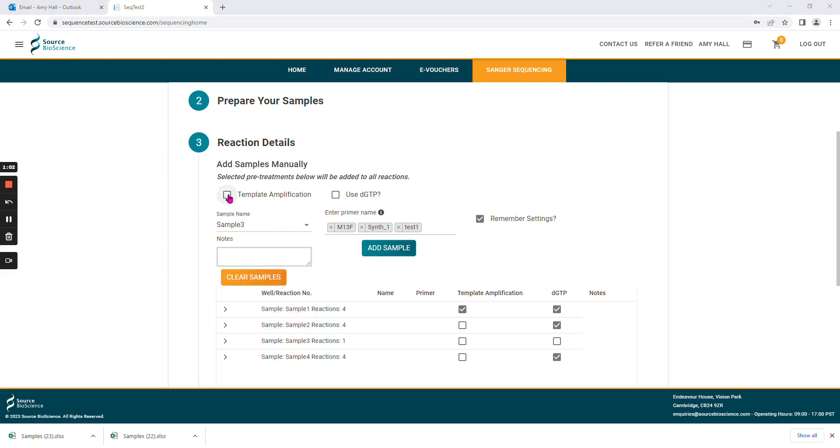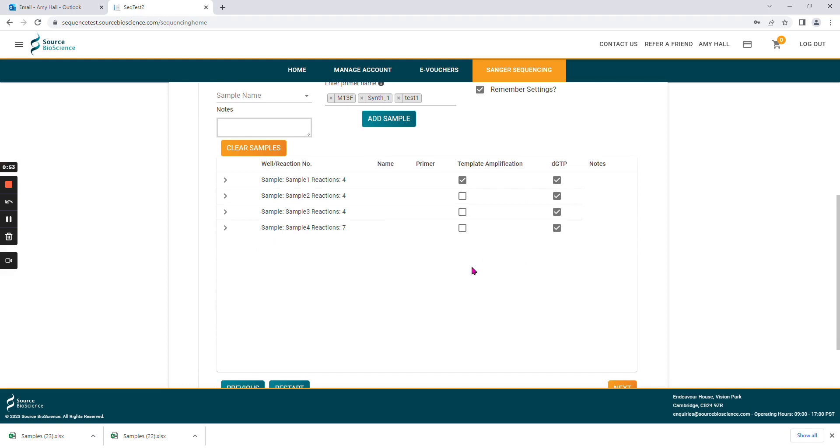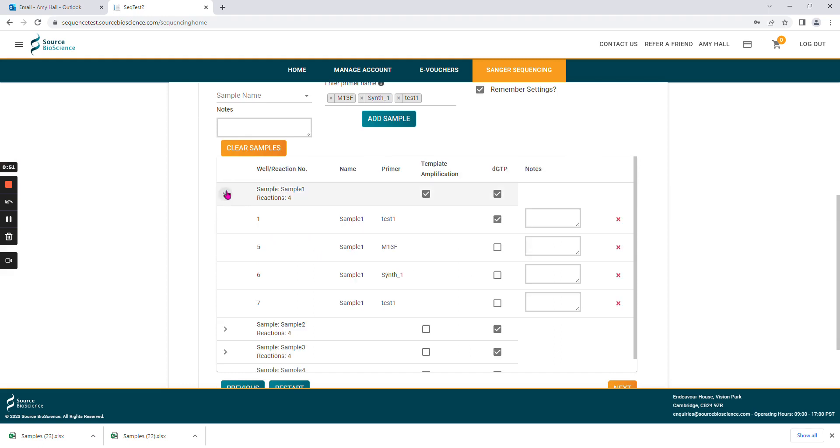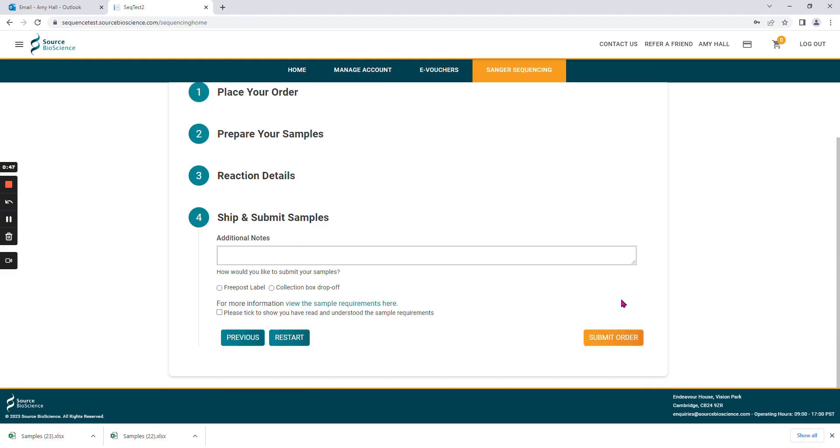You can also choose to add pre-treatments, and this will remember your selection for the next sample. Please check that your reactions are how you expect them to be, and then select next.